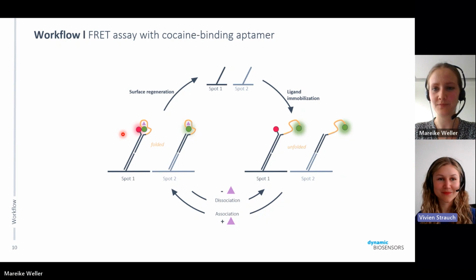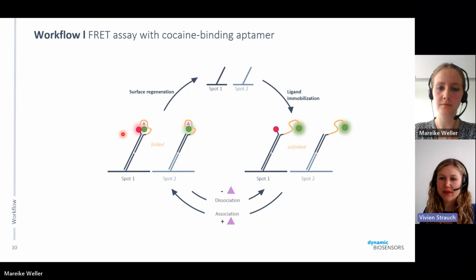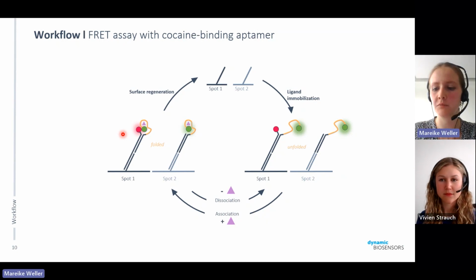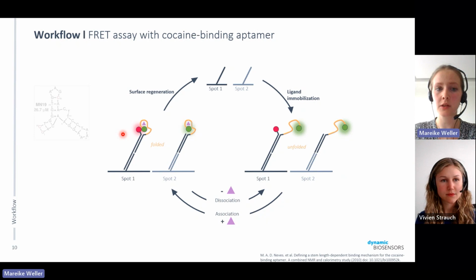Yeah, maybe we can stick a bit to this conformational change, because there are also some questions about this. The sensitivity of the system for the formation of the secondary structure. I think this relates mostly to the thread sensitivity. Yeah, so this is heavily dependent on the change.